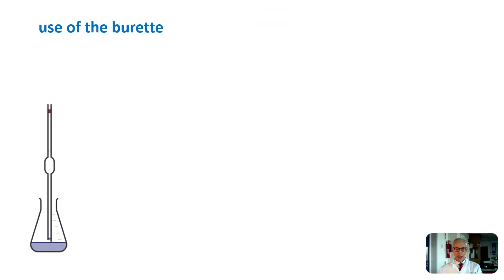We have 25 centimeters cubed of a solution of known concentration in the conical flask. We now need to prepare our burette and the burette solution. The process for preparing the burette is the same as for the volumetric pipette. That is, you rinse the burette with tap water, then with distilled water, then with a little of the solution.